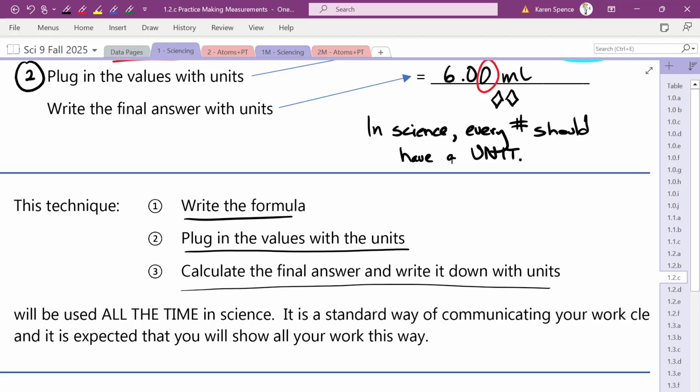But we learned something, right? You can turn the whole thing around towards you so it's easier to see the opening.